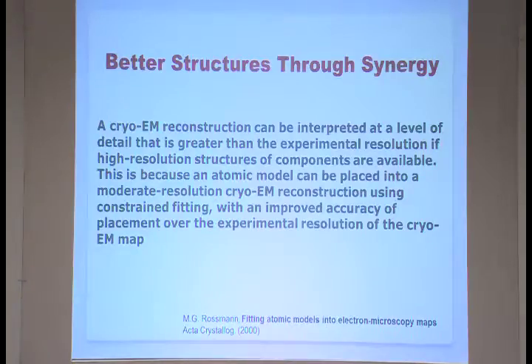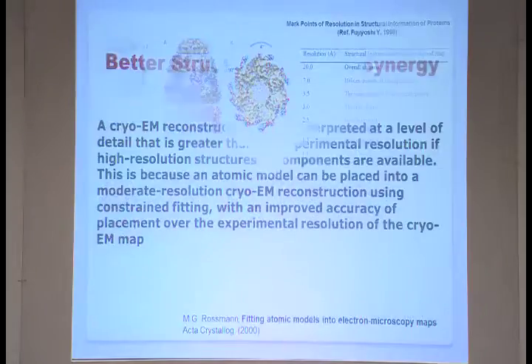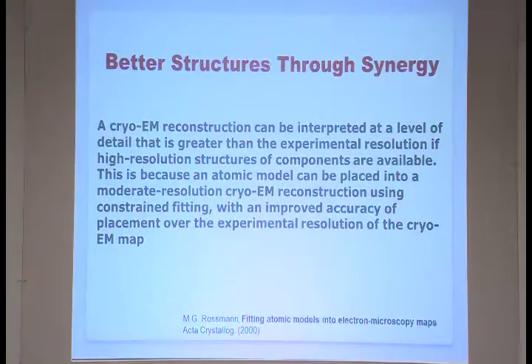Actually Michael Rossmann showed in a paper that the accuracy of any structure molded in a cryo-EM map depends on the resolution, and it's about a factor of 10.